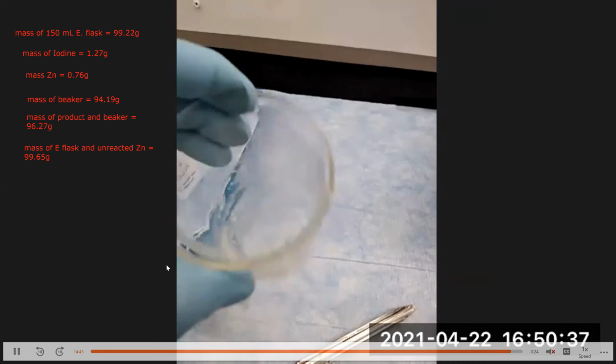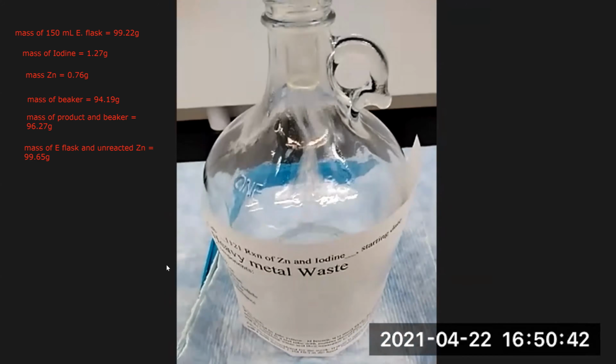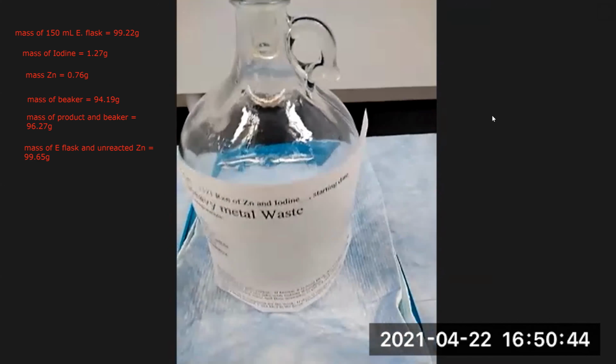Again, I'm cleaning the beaker and then I'm pouring my washings into the glass bottle. So now let's take a look at the data we recorded, and let's see if we can calculate the formula of the zinc iodide product. Let's see how well our teaching assistants did.